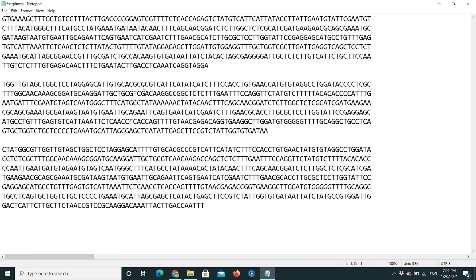Hello guys, welcome to NCBI session. Today I'm going to show you how to submit your nucleotide sequences through NCBI. First of all, it is very important to make sure your sequences are correct and have quality to submit to NCBI. To submit sequences through NCBI, you need to make a couple of changes.